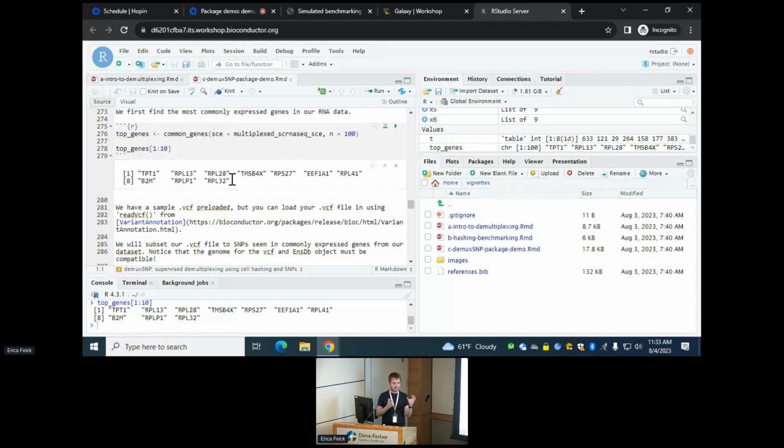So they're looking for signals in the data, and when there was a large mismatch in size between the different groups, sometimes they could pick up different cell types instead of different groups. Because we're looking at mRNA, we see different genes being expressed in different cells, and so this goes some way towards mitigating that. It's something that we've yet to formally benchmark, but we expect by doing this, it somewhat reduces the cell type bias.